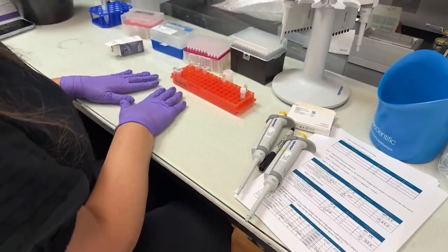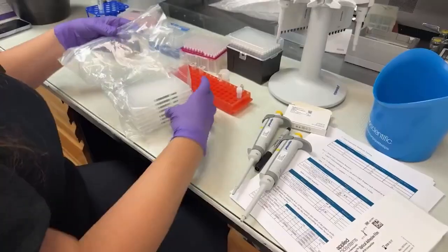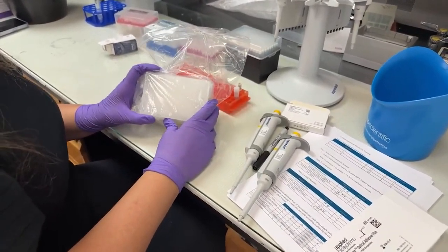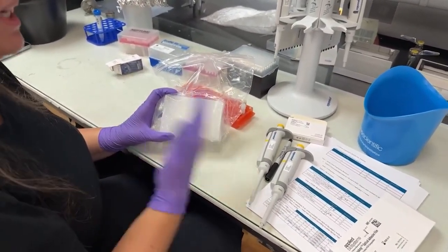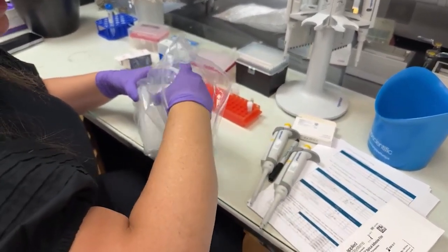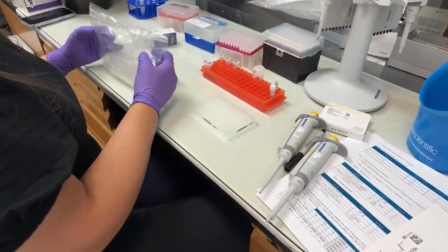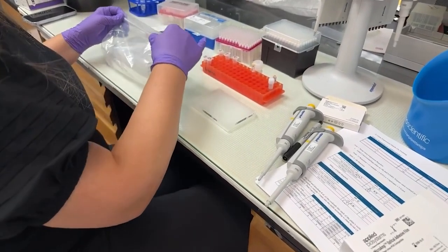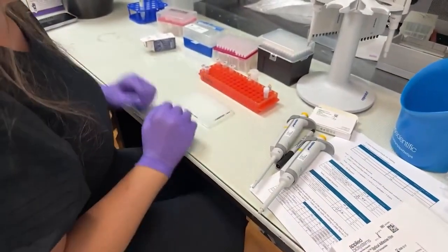All right, I'm going to put that to the side and talk about our plate and plate seal. So these are the 384 well plates. They are the same size as running 4 96 samples. So 96 times 4 is 384. The individual wells of those 2 formats are different sizes. So make sure you check that table I showed you earlier about which size reactions go in which instruments, but for today and all the instruments in the bio garage, this 384 well plate is going to be what we're going to work with.